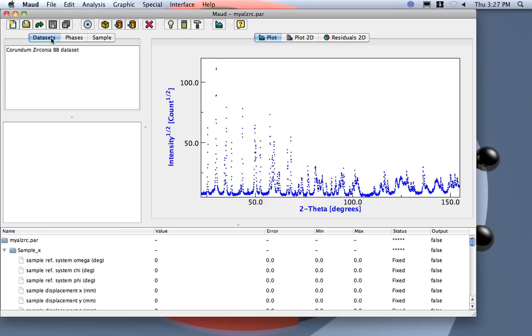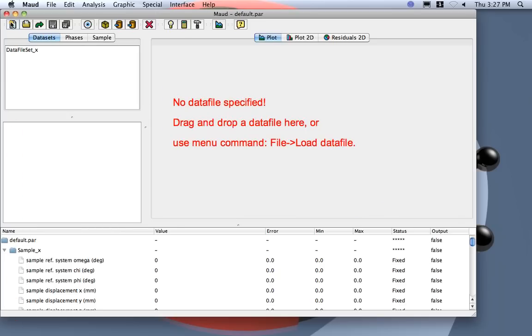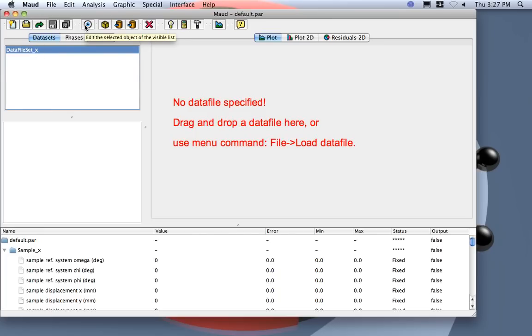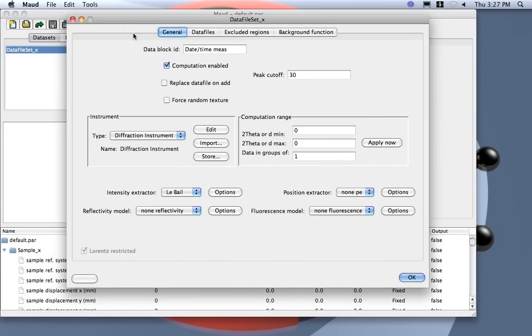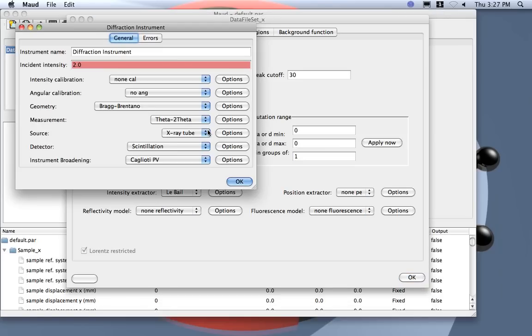So I start a new one. First I go to the dataset and I have to define my instrument and load the data. I prefer to first define the instrument, so it is a diffraction instrument. I edit and then I will call this APS.